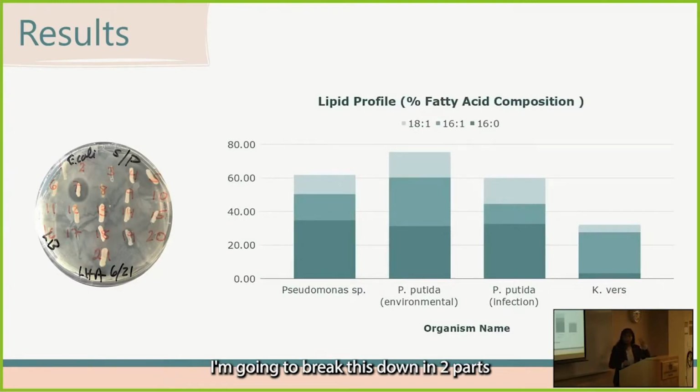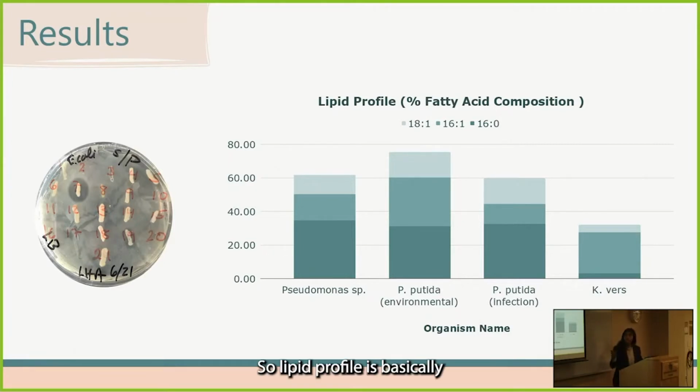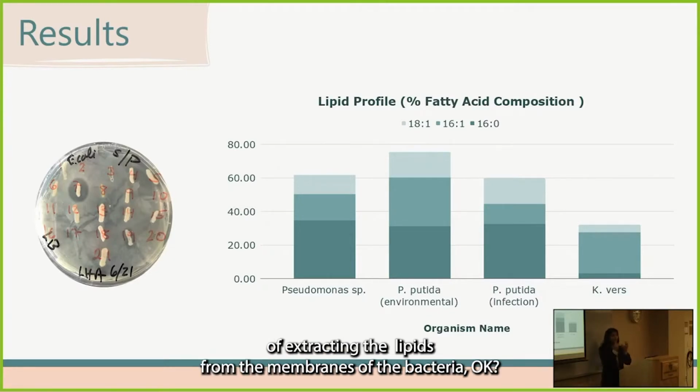I'm going to break this down into two parts. First, I will tell you kind of what a lipid profile is, and then I'll reiterate the purpose of the lipid profile, specifically in the context of my research. So a lipid profile is basically, you have your bacterial sample, you go through a process of extracting the lipids from the membranes of the bacteria, okay?